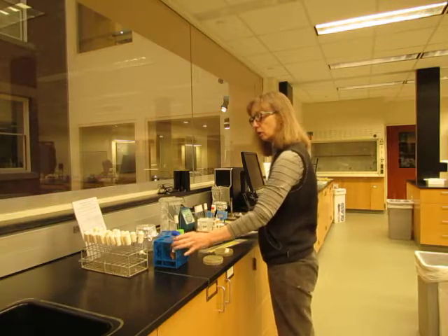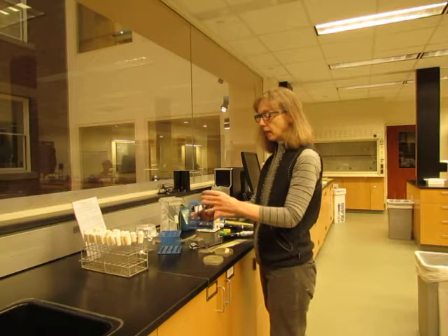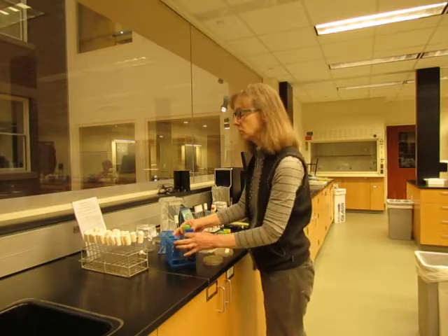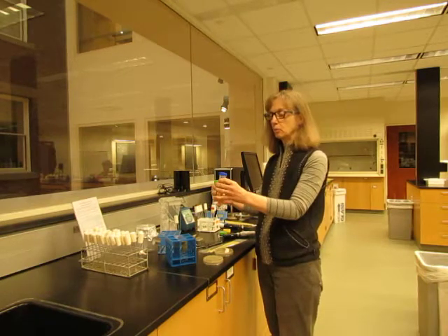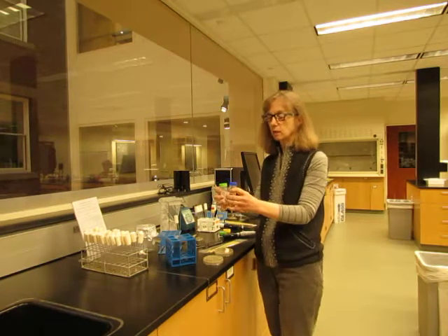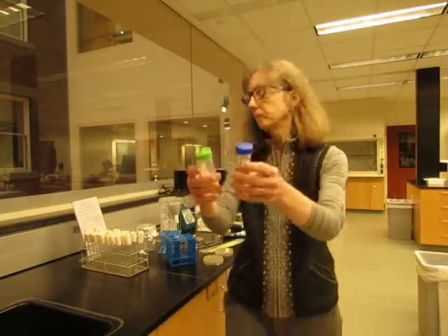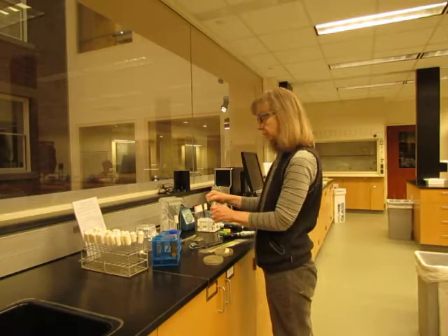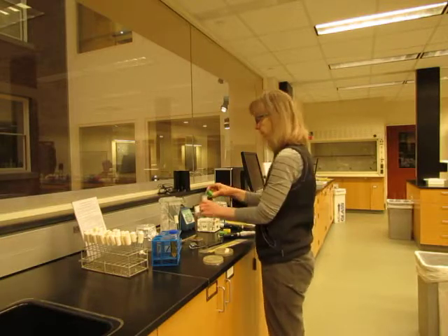Then you would go to the refrigerator and get out the culture media. We have two different tubes: one marked with an L for low phosphate media, and the other with an H for high phosphate media. I'm going to prepare a low phosphate culture, so I will unscrew the top and again briefly flame it.